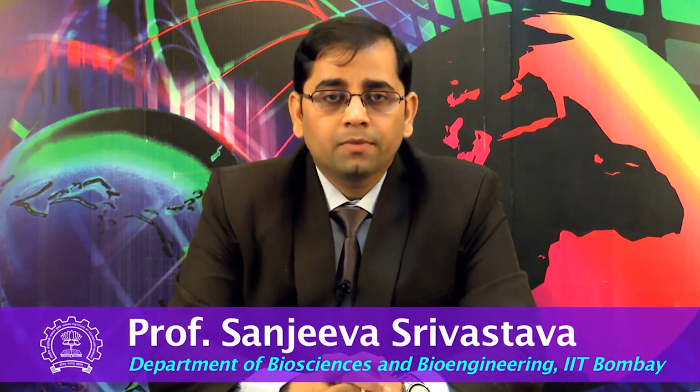In today's lecture, Ms. Nikita Gehoy, a final year PhD student in my proteomics laboratory at IIT Bombay, will talk to you about one of the applications of protein microarrays in cancer research. As you are aware, we can have different types of protein microarray platforms. Of course, if you need the purified proteins, that is much more laborious and a big task.